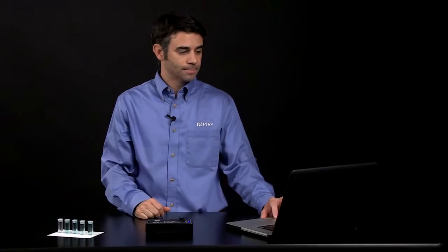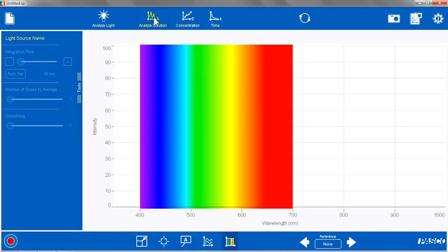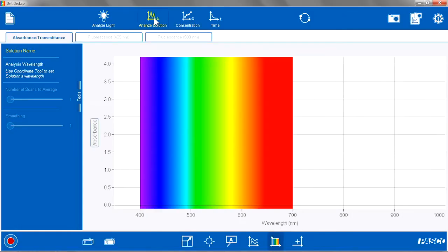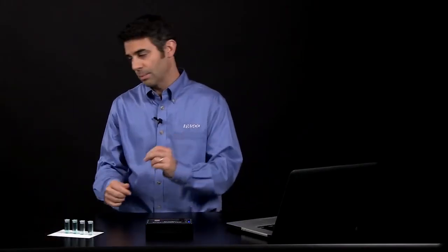After I pair everything, I am going to go to the spectrometry program, and I am going to go to Analyze Solution. Once the Analyze Solution page is up, I am going to have to calibrate my spectrometer using a blank.